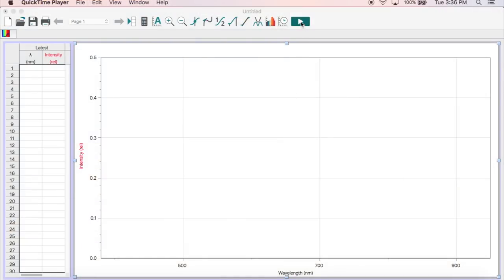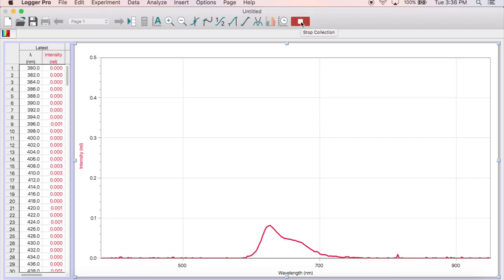In LoggerPro, press the green collect button and wait a few seconds for the data to be collected. When done, press the red stop button.